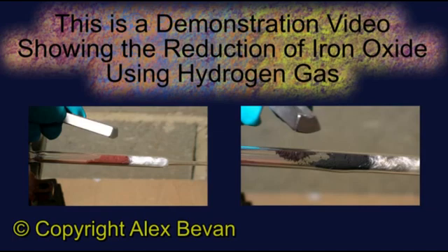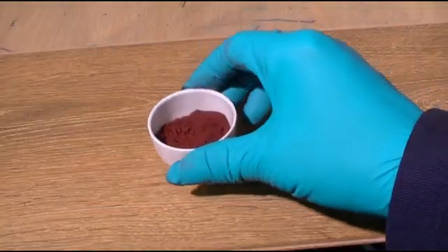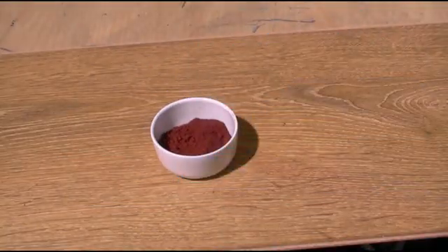This is a demonstration video showing the reduction of iron oxide using hydrogen gas. Iron oxide can occur in multiple states. In this demonstration, we are going to be reducing hematite, which appears reddish orange in color.